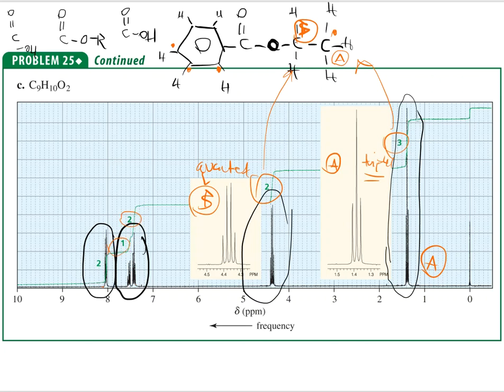I see a 2 and a 1 and a 2. What that means is that here in the ortho positions, those would be 2 equivalent hydrogens. Here in the metas, those are 2 equivalent hydrogens. And then here on the para, that is 1 equivalent hydrogen. I would see a 2-2-1 there, and I see a 2-2-1 here from that benzene ring. So once again, it makes me feel really good that this possibly is the structure of that NMR that we have.